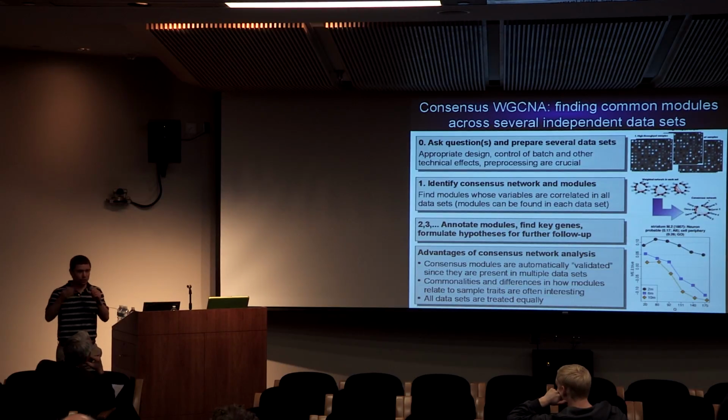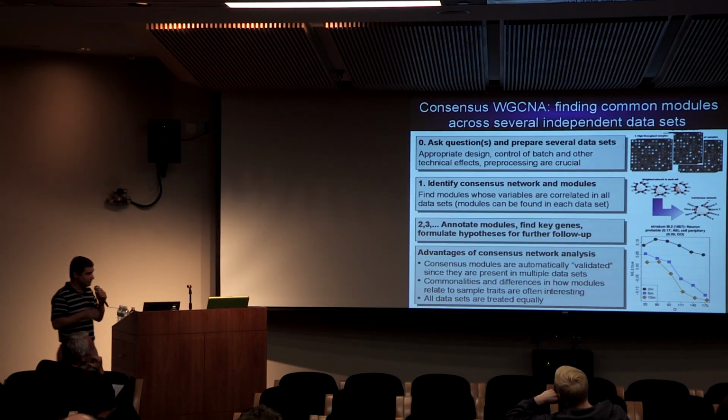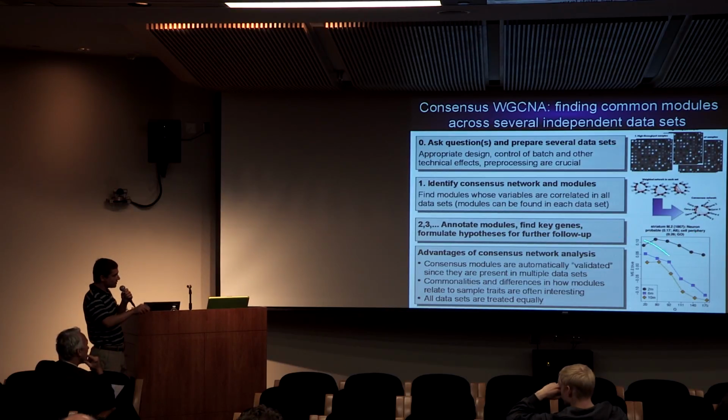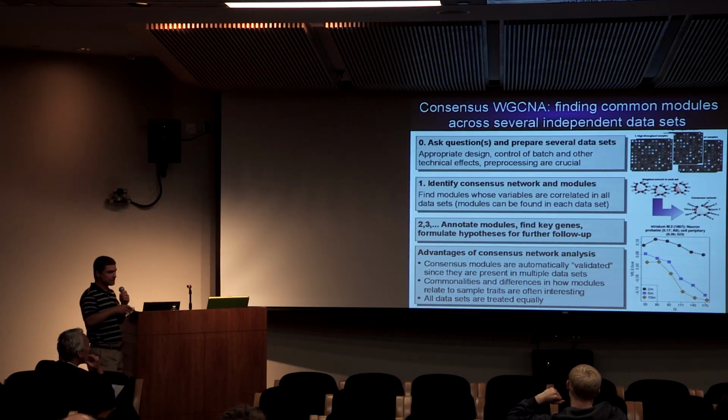So if you know what the data sets were, in this case, one was from young mice and the other was from adult mice or older mice, something is changing in the older mice. The older mice do respond to this quantitative variable, whereas the young mice do not, or not really. So this is something that a consensus analysis can give you.